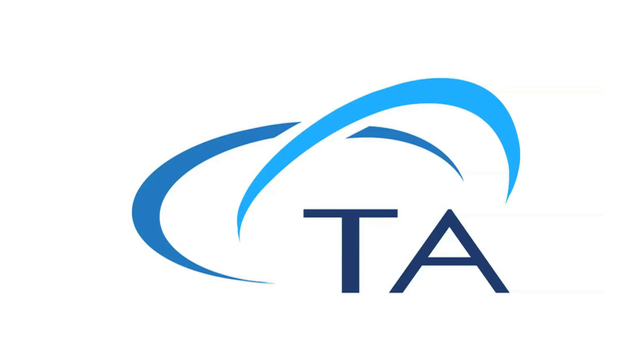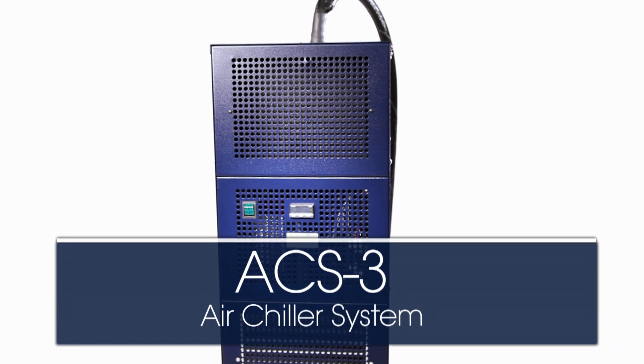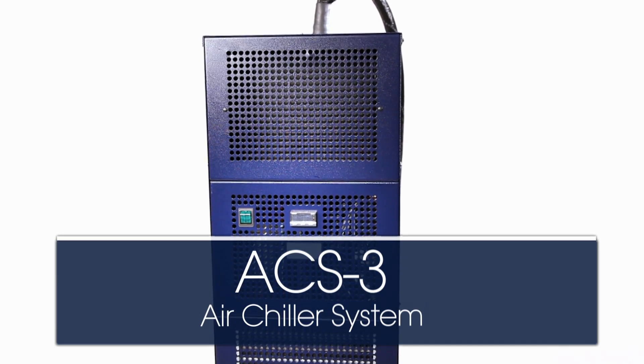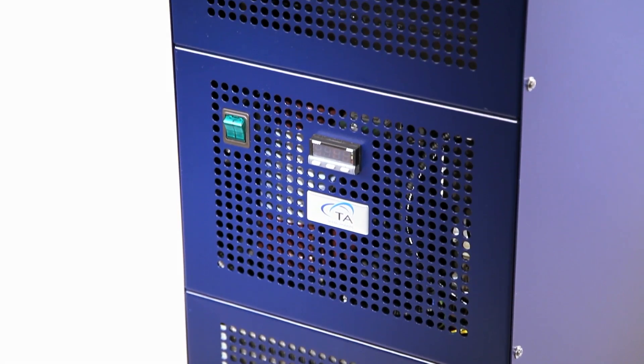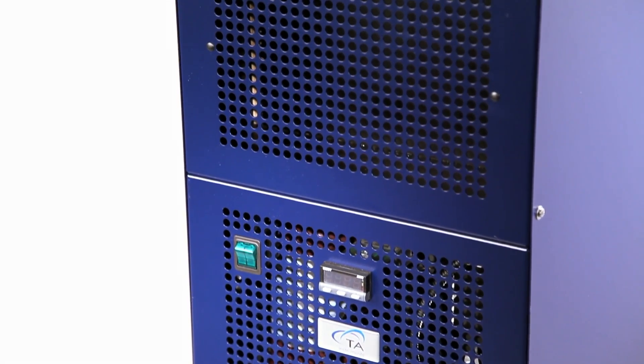TA Instruments is proud to introduce the ACS3 air chiller system, a new choice in cooling for rheology and DMA. The ACS3 is an efficient mechanical cooling system that makes operation at low temperatures convenient and affordable.